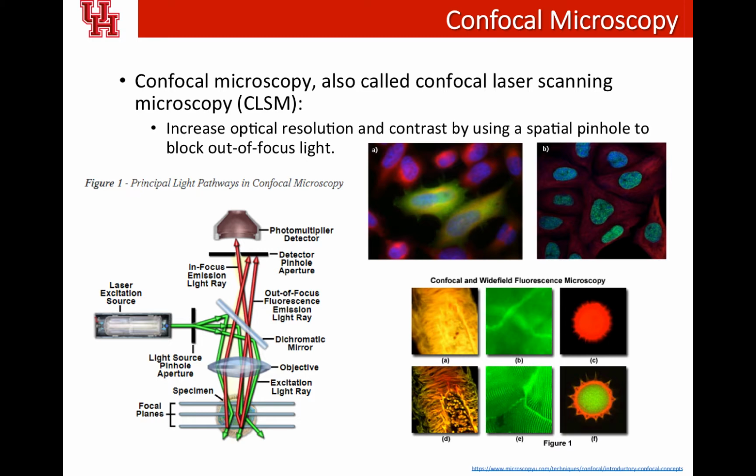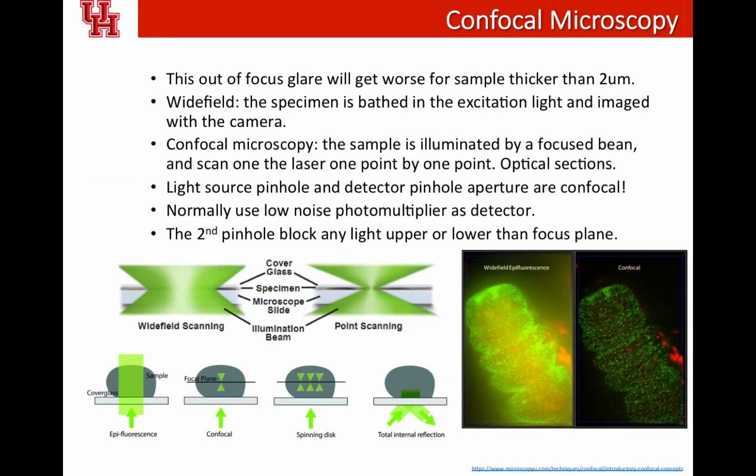through your entire surface. So that's called optical sectioning, right? You just section one layer really quickly, and then you move your focus, and then you section the second layer, another layer on top of your first layer, and you can do it relatively fast. So now you can do it at maybe 1 frame, or even 20 frames per second. Okay, so that's the confocal, right?